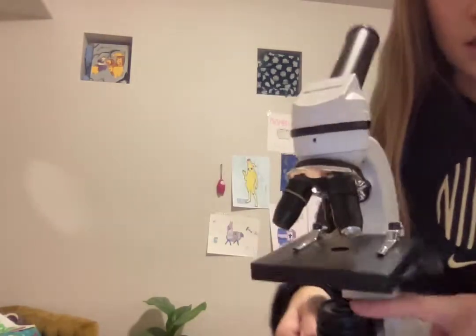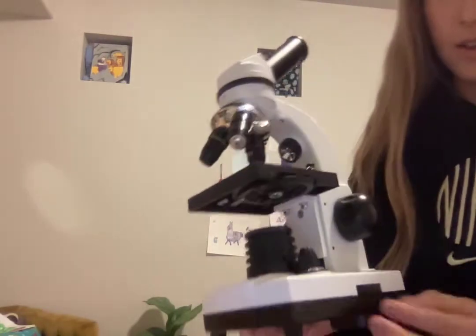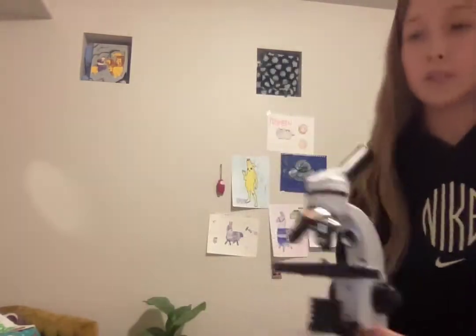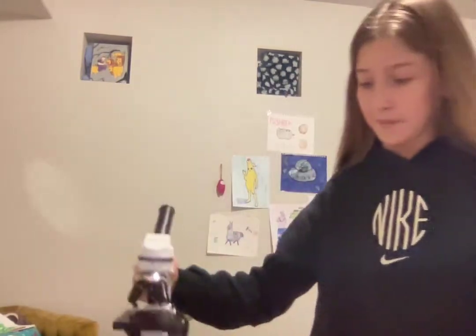There's one light right here, and also another light right here. This moves up and down, and this dims what you're seeing. It's a really nice microscope. I got it on Amazon for $89.99, and it also came with all of this stuff.